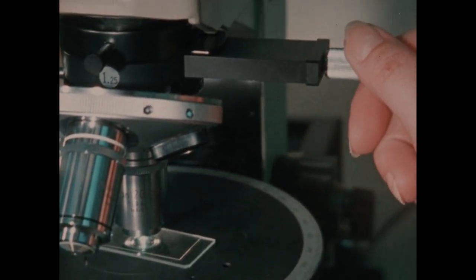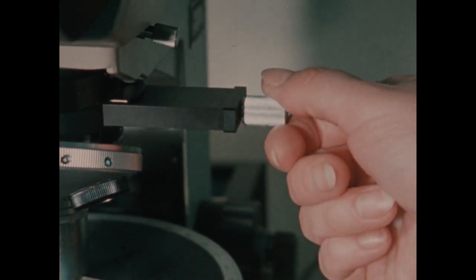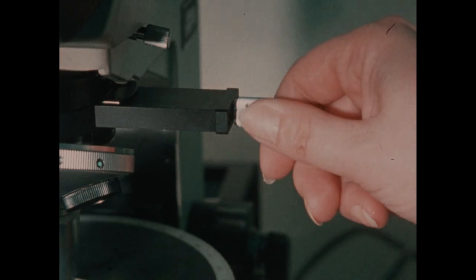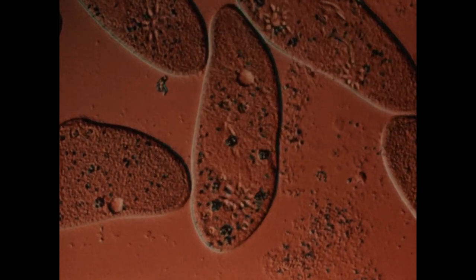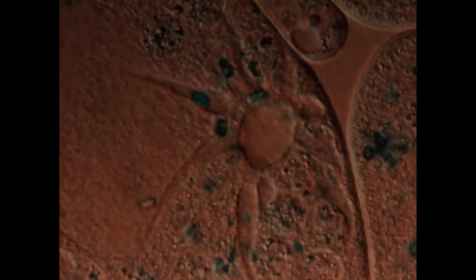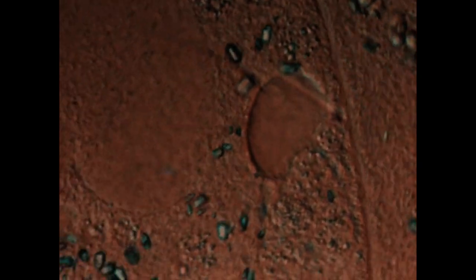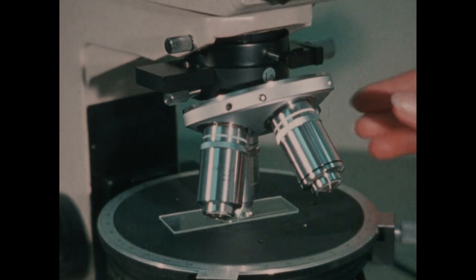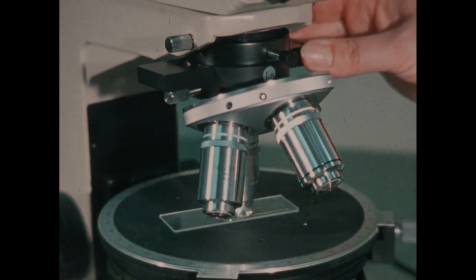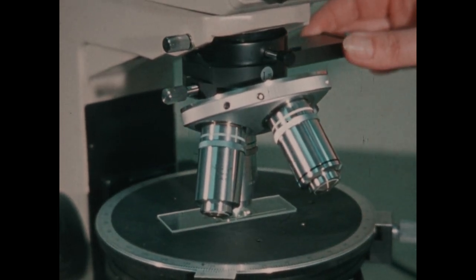The other and newer lighting method, differential interference, uses a polarization process to produce a different kind of image. Here there is a feeling of looking at an optical slice cut through a living cell. A researcher may need to use all of these forms of lighting to interpret the hidden world.